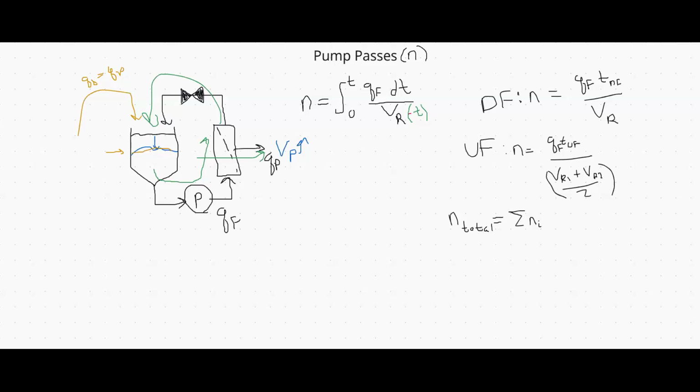But first we'll go over a solution that I don't know who came up with, but we'll get started with that. It uses this equation here and accounts for both diafiltration and concentration. So we're going to go over that now. First, I'm just going to circle these so we know this is one way. We'll put a 1 like that.